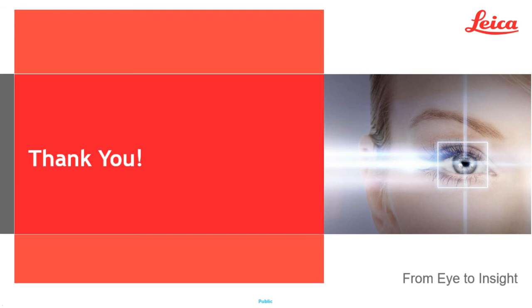Whether it uses all that information to build your random forest is slightly different. It's going to use whatever is best to classify your data. That could be just how 2 pixels relate to each other, or that could be how the entire cell relates to the next cell. So it varies quite a bit in what gets pulled out eventually, but it does take a look at everything.